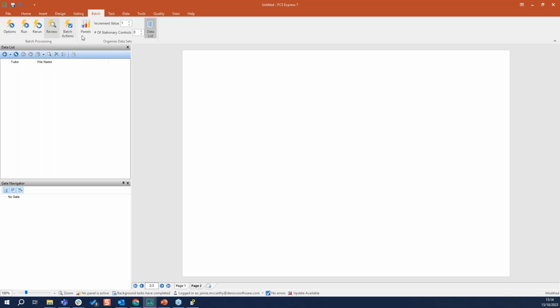If I want to start exporting some of my data, I can come to the batch tab. We're going to go over batch analysis a little bit later.